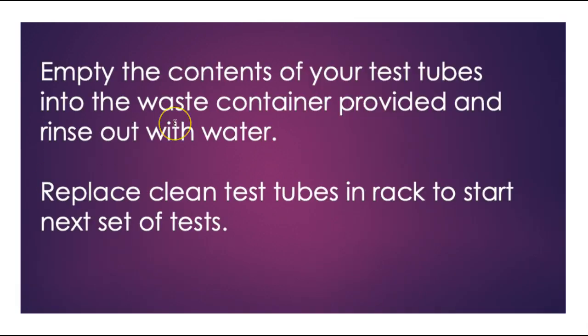Last but not least, every single one of your test tubes have to be thoroughly cleaned out so that they are absolutely clean for the next person to come along. You put any wastewater into your containers and make sure that it's set up exactly the same as it was before when you started for the next lot of students to come in.